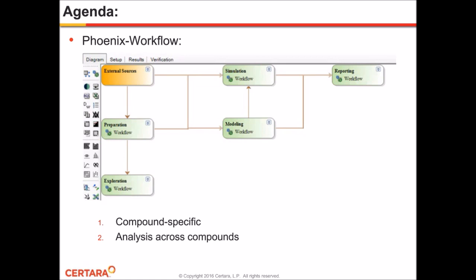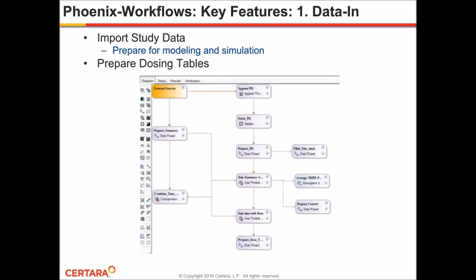So if you look at the data in operations, you've seen importing the study data from, in this case, Excel was straightforward. You just import it right away. And then there are just a few steps in preparation, but these are really highly efficient because they get you the data into the proper format ready for Phoenix analysis.